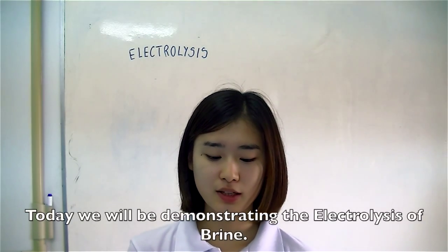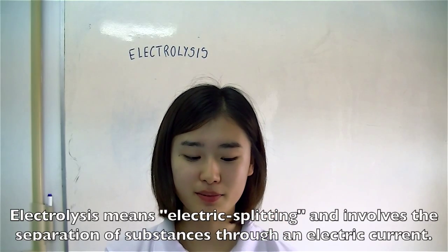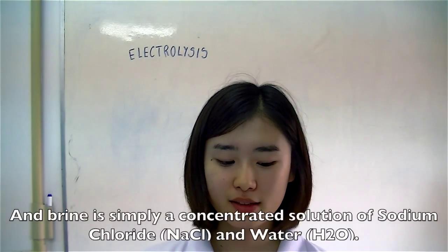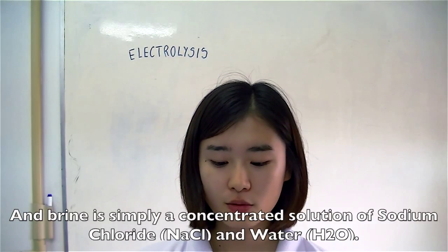Today we will be demonstrating the electrolysis of brine. Electrolysis means electric splitting and involves the separation of substances through an electric current. Brine is simply a concentrated solution of sodium chloride and water.